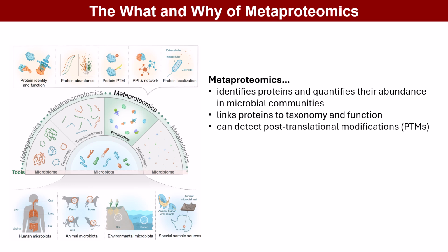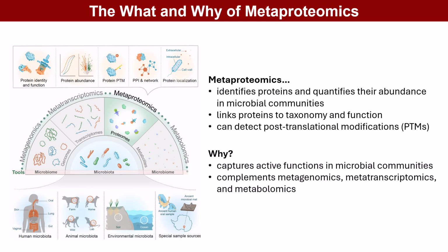Why is it important that you incorporate metaproteomics in your workflow? Well, with metaproteomics, you can capture the actual active functions of microbial communities and are therefore ideally suited to complement other omics fields. It is therefore not a surprise that it has a wide range of applications, including microbial ecology, host microbiome research, improving biotechnological processes such as wastewater treatment, and environmental monitoring. Metaproteomics is even being applied to unique sample types, such as ancient microbiomes.